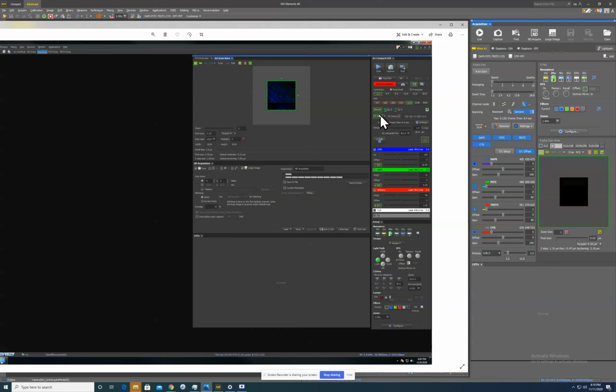Right below that, you have the channel series button. We basically always say the channel series should be on. So what channel series does is you have your 4 laser lines and you have your fluorescent markers, and the fluorescent markers respond to particular excitations. So the way this is supposed to work, if you have channel series engaged, is that it engages the first laser line, which activates your first fluorescence, and then it collects all that information, turns off that first laser line, turns on the next laser line, collects that fluorescence, turns it off, etc.